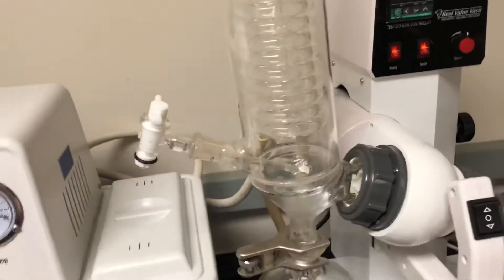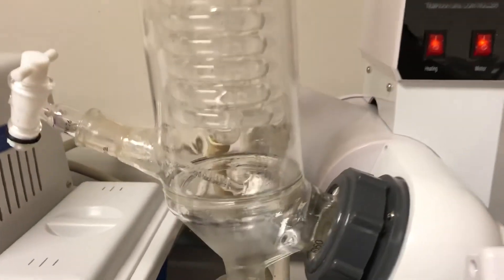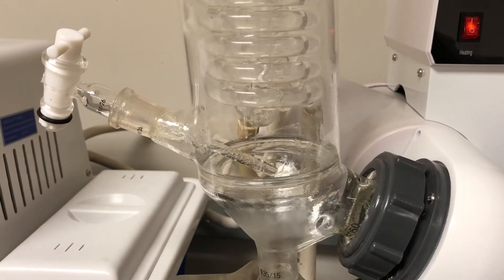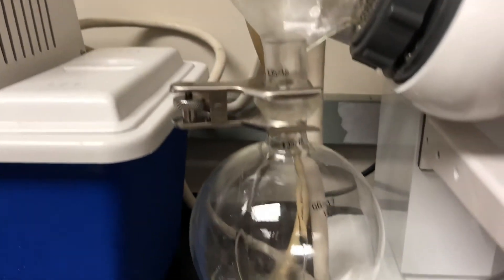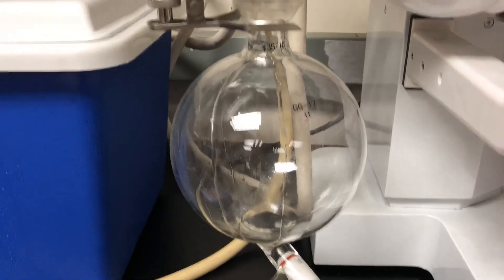All right, so remember, we can see we have some pretty good condensing going on here. We're going to put a clip down and let's wipe this boat out.